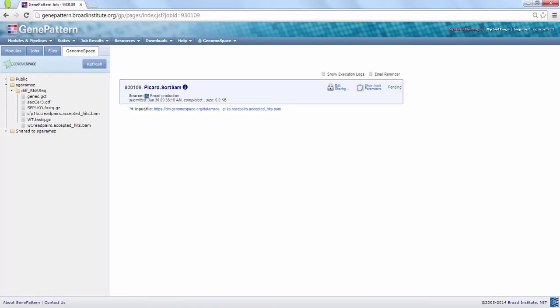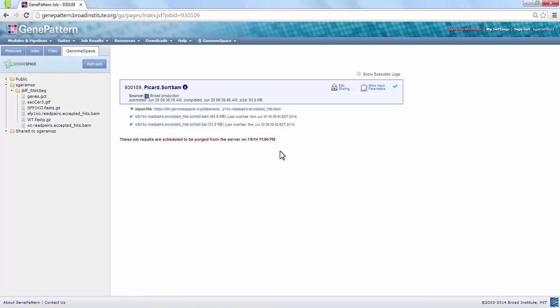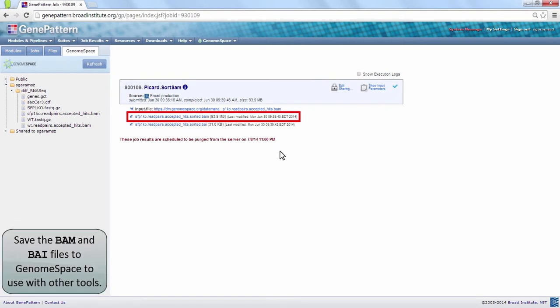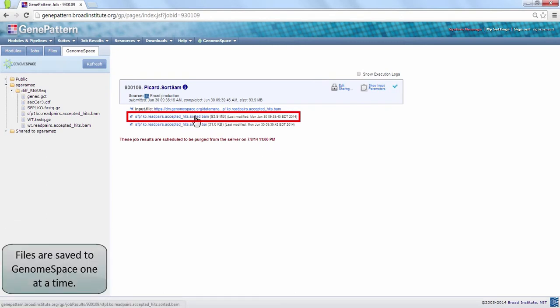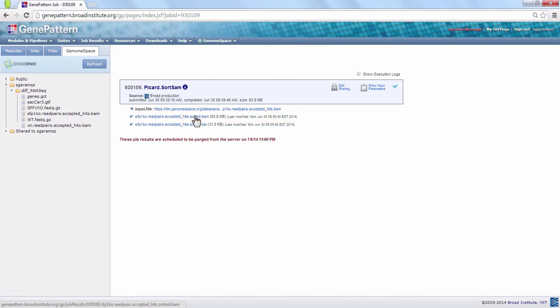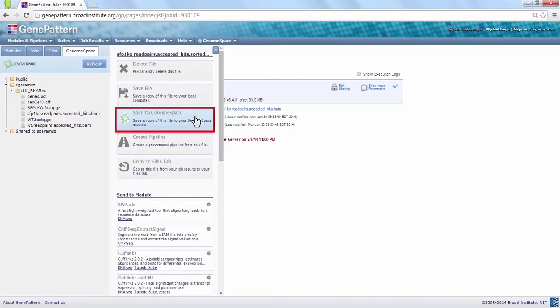Once the job is complete, save your outputted BAM and BAI files to your favorite GenomeSpace directory for future use. Click on each file and choose Save to GenomeSpace.